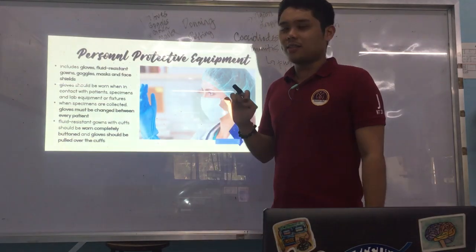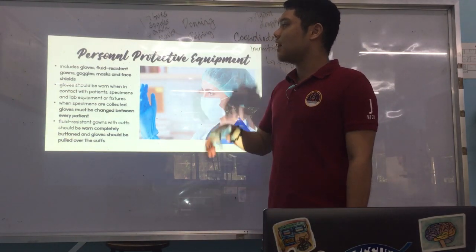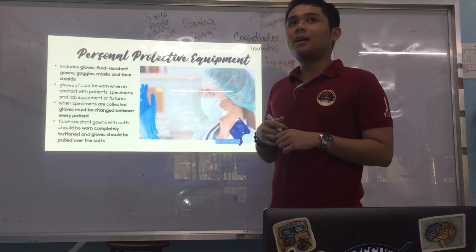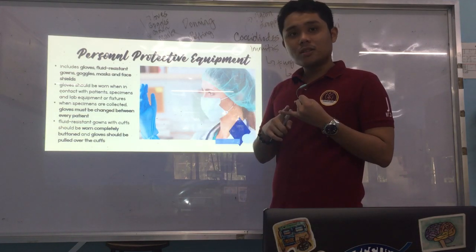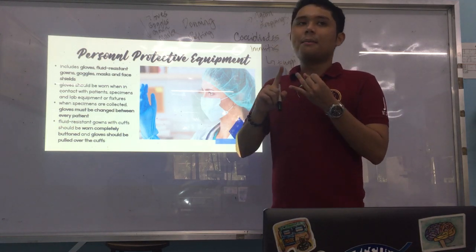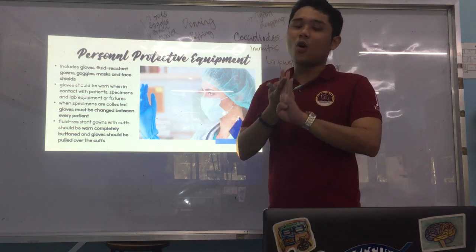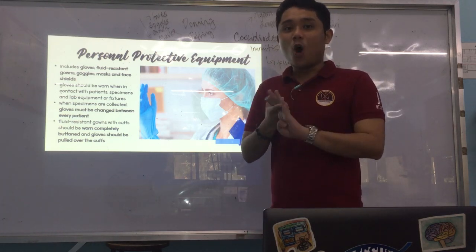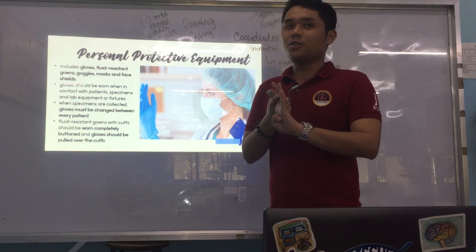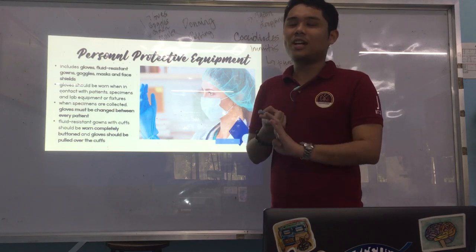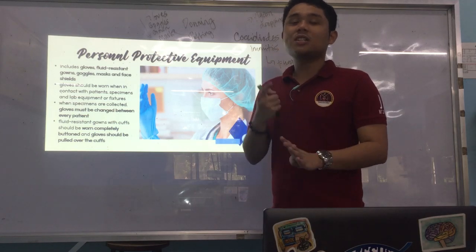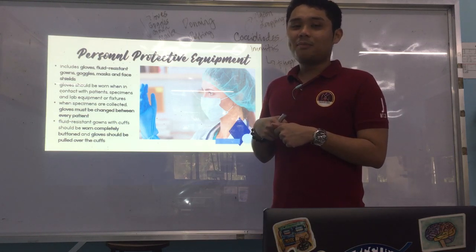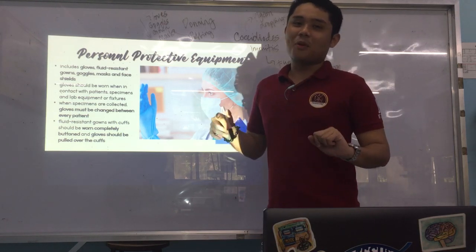There was a board exam question asking: which of the following is NOT a PPE? The choices were goggles, mask, N95 filter, and alcohol. The answer is alcohol. N95 filter — also known as a HEPA filter — is found in the N95 mask, so it can be considered a PPE. Alcohol is not classified as a PPE.